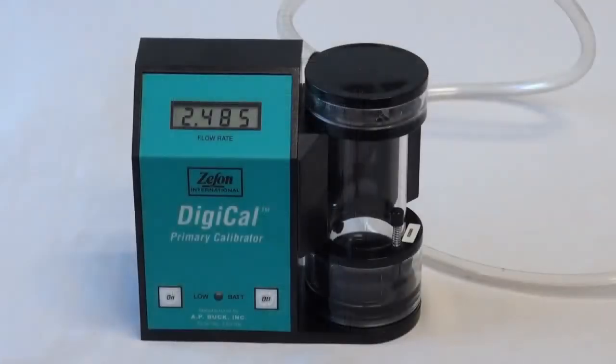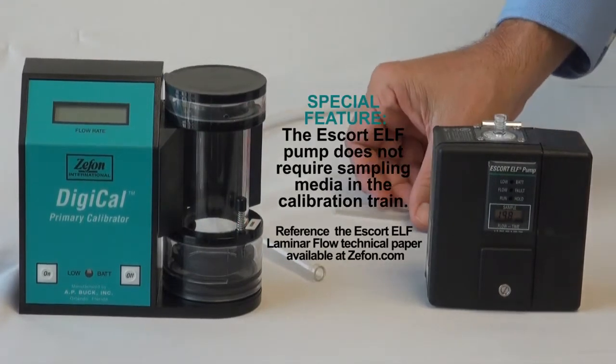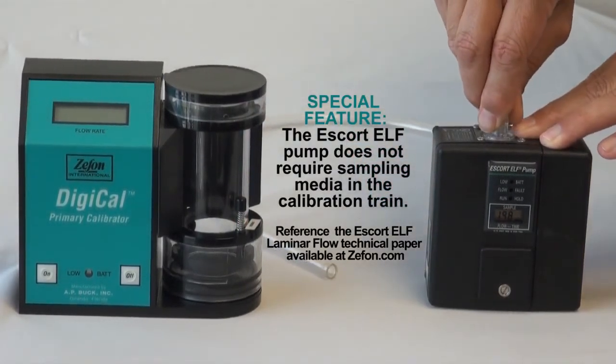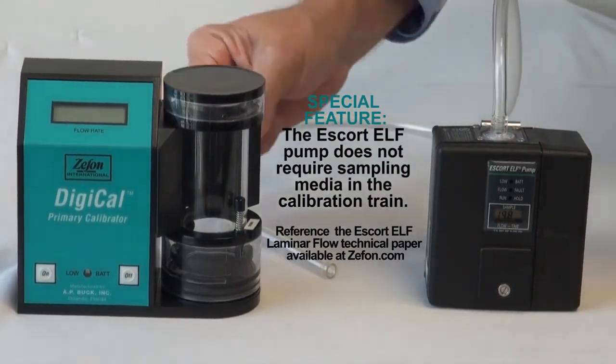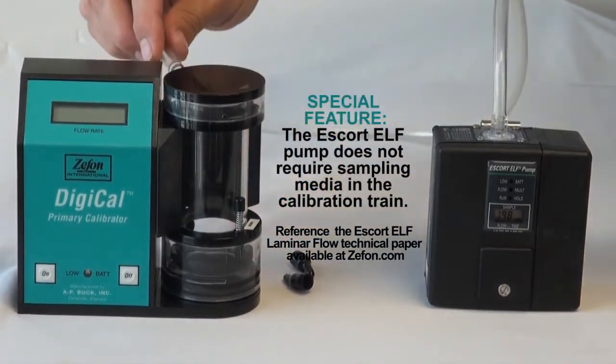For our demonstration, we will be using the Zefon DigiCal 5 as our primary standard calibrator. Connect one end of the tubing to the Escort pump, then connect the other end to the primary calibrator. A unique feature of the Escort pump is that it doesn't require the sampling media in the calibration train.